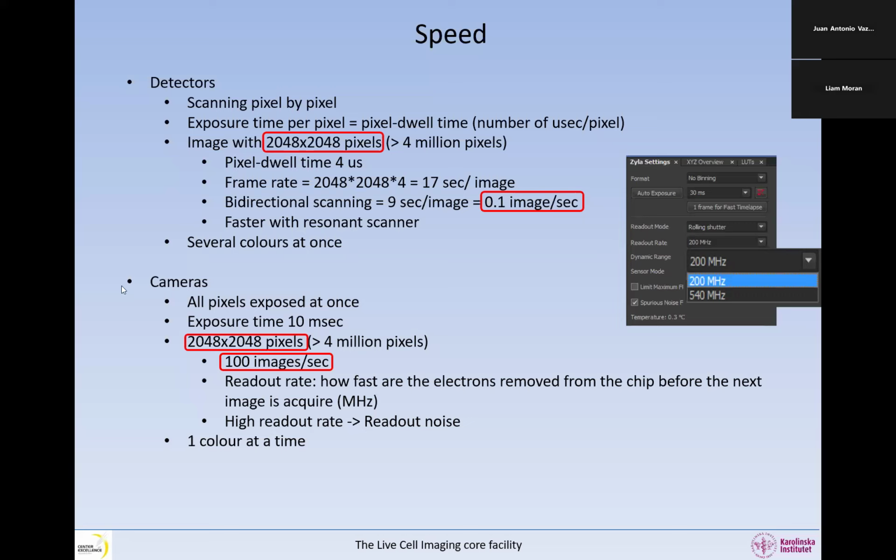And I want to say that for all camera-based systems, it's not 100% true, depending on what you have, but if your system is a little modern, we can say that the speed limit of how many images you can collect just depends on the camera. It doesn't depend on other things. If you have a decent computer, it will depend on the camera specifications.